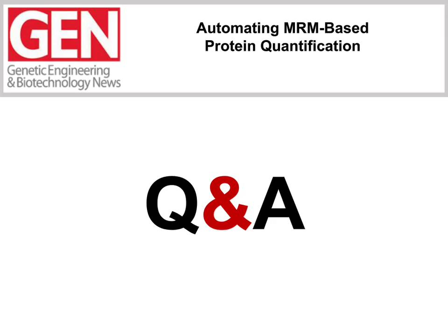Hardly any signal is detected, but I think they are designed to be single use. But maybe you have to try, I think. But for real samples, they're single use.